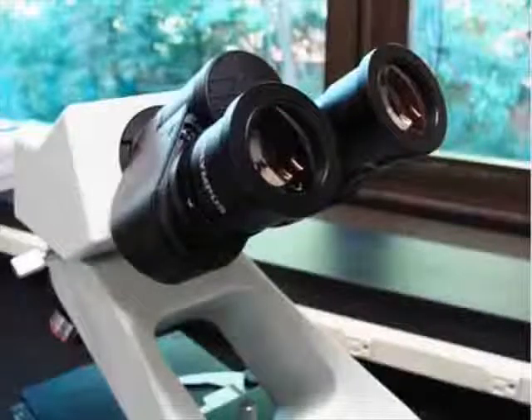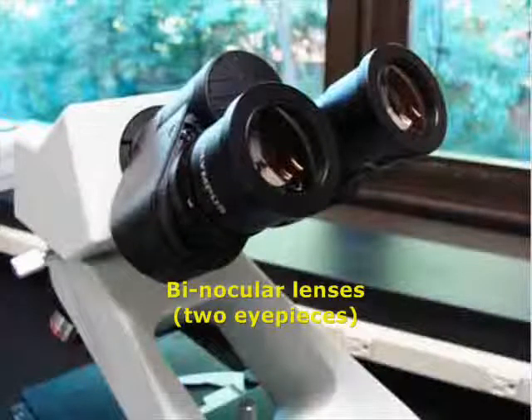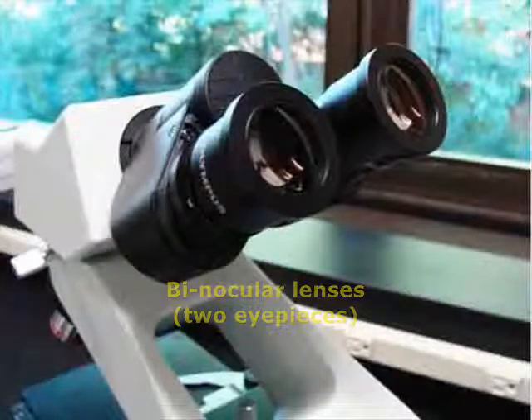Compound microscopes have either a single ocular lens or a set of binocular lenses. The ocular magnifies the specimen 10 times actual size.